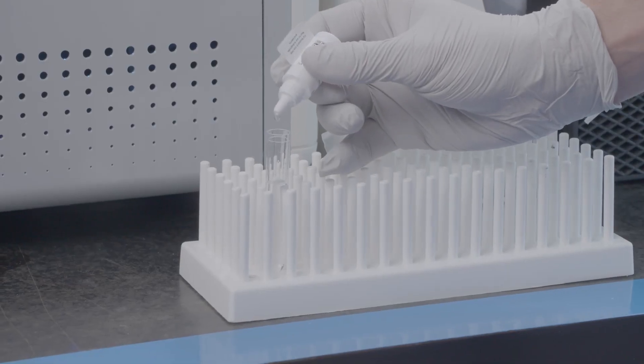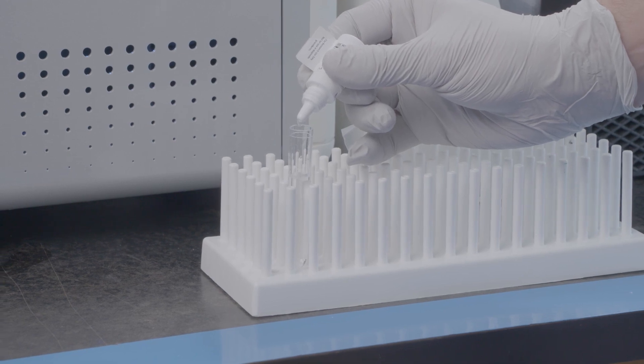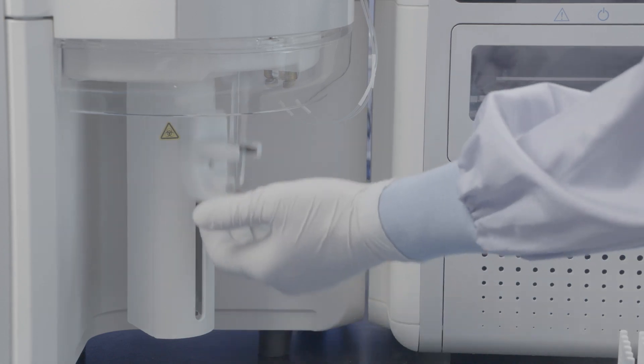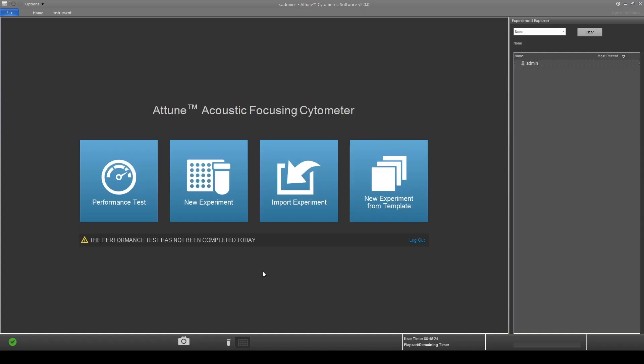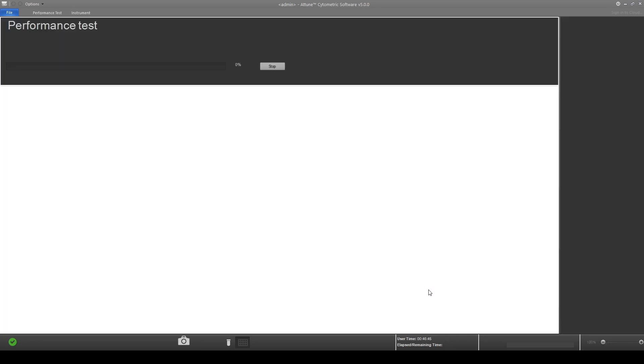Now to run a performance test. Load a tube containing three drops of performance test beads to two milliliters of focusing fluid. Lift the tube into the sip. Click on the performance test icon and verify configuration and bead lot number. Confirm beads are mixed and loaded into the instrument. Once all is verified, click on run performance test.